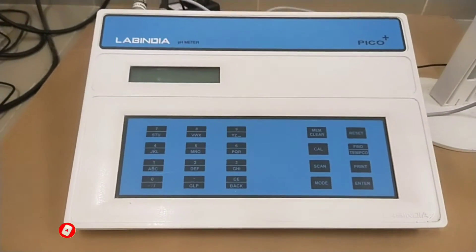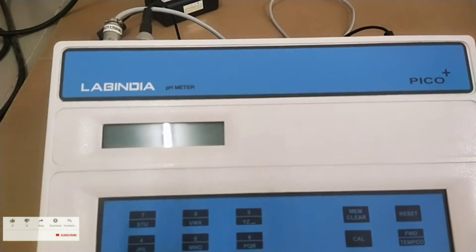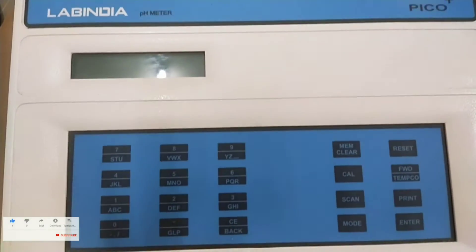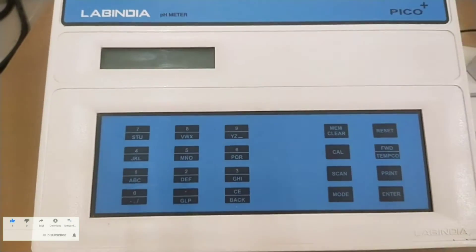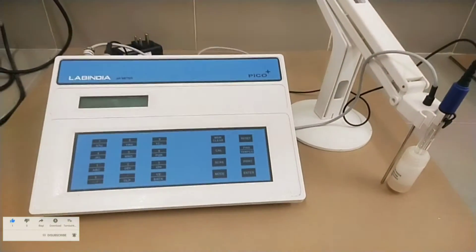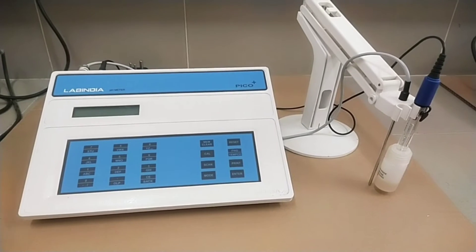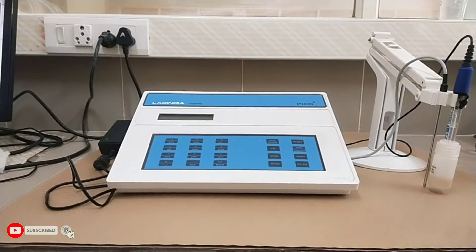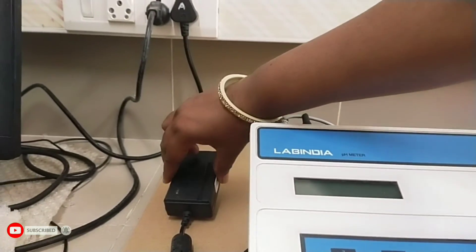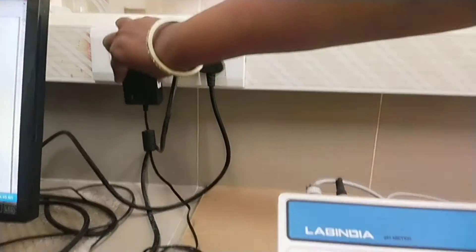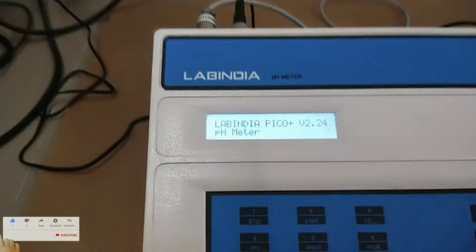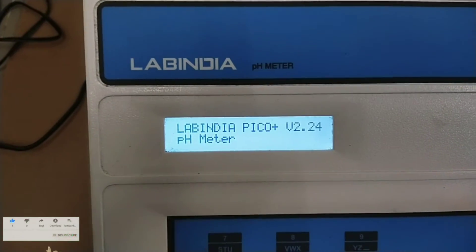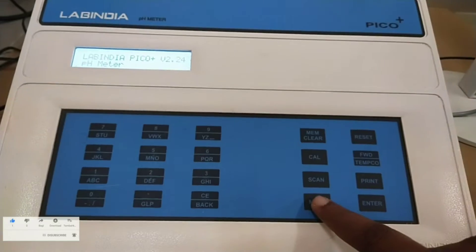It is LCD display to display the values. Before switching on the instrument ensure proper mains fuse has been installed in the instrument. The pH meter uses detachable DC adapter with ETH connection. If adapter becomes damaged, replace immediately with same rating and same specifications. Connect the DC adapter. Now switch on the instrument.